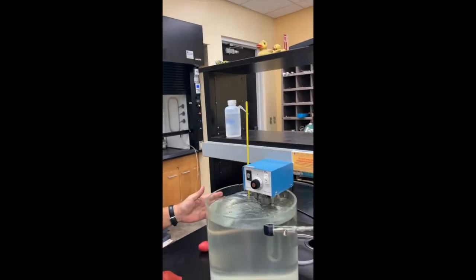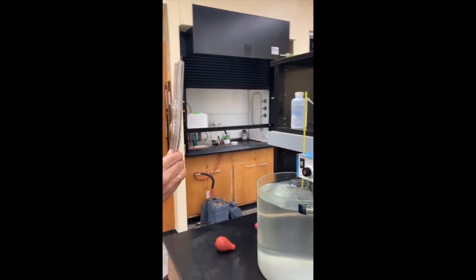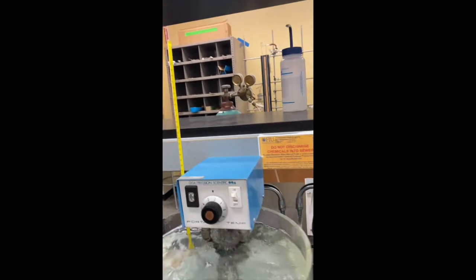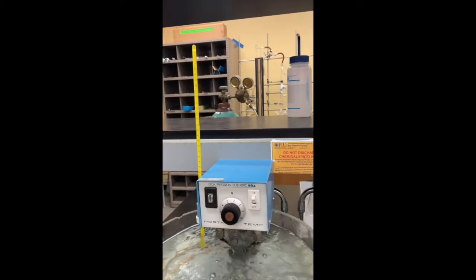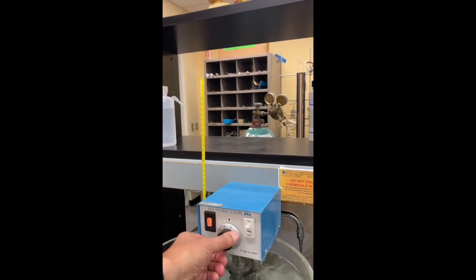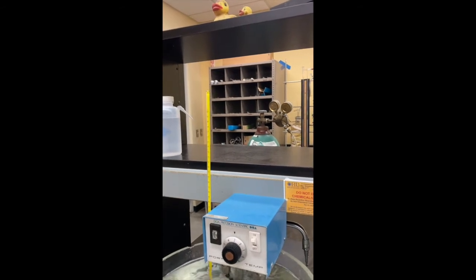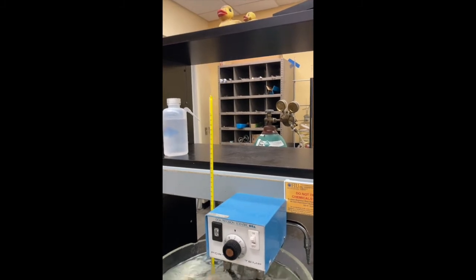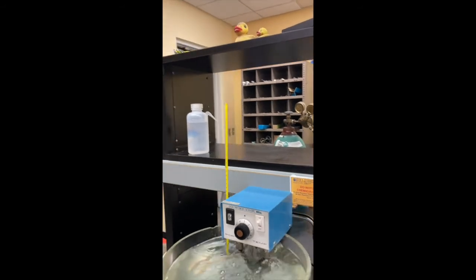In order to maintain constant temperature, because viscosity strongly depends on temperature, we use this water bath, and it is connected to a heater, and we have a thermometer. During the experiment we must maintain a constant temperature by adjusting this heater. Now the heater is on, now the heater is off, but it is important to monitor the temperature, write down the temperature reading maybe every 10 minutes or so, but make sure that all measurements are done at the same temperature.